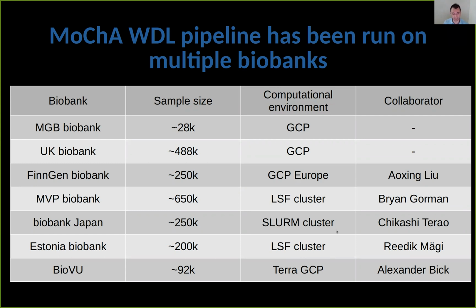Something you might notice is that because of different restrictions with different biobanks, we actually had to run the pipeline on a very different array of computational environments, from LSF and Slurm clusters to Google Cloud European clusters. But this is a testament to the fact that the pipeline that we structured actually can run on almost any biobank.